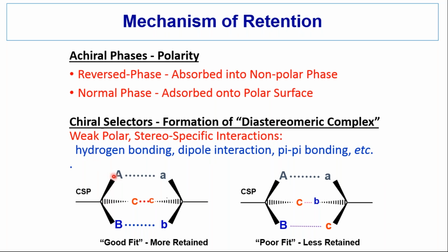So the interactions of the analyte with the stationary phase, instead of being bulk properties, are generally stereoselective or stereospecific interactions. They're generally weak polar interactions, so hydrogen bonding, dipole-dipole interactions, pi-pi bonding, etc. So in this example, just to make up examples, say the stationary phase has a hydrogen bond acceptor, a pi base, and a dipole. If we have a hydrogen bond donor, a pi acid, and the dipole of the opposite orientation, these will interact strongly, and so there's a good chance we'll have good retention.